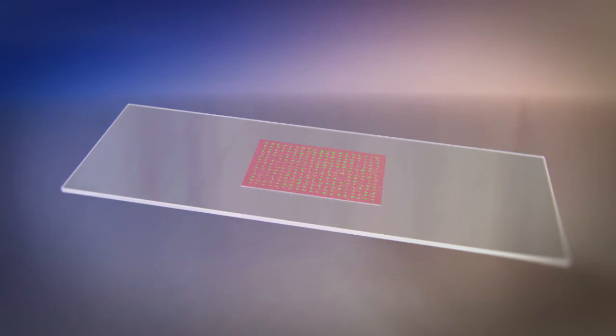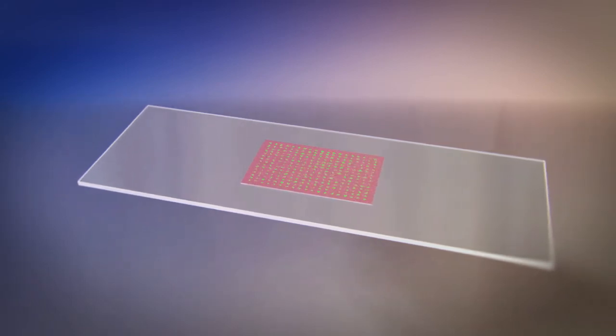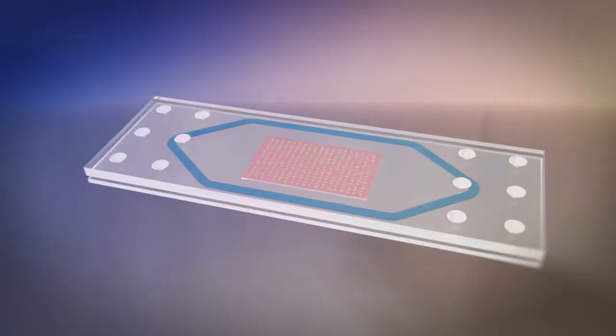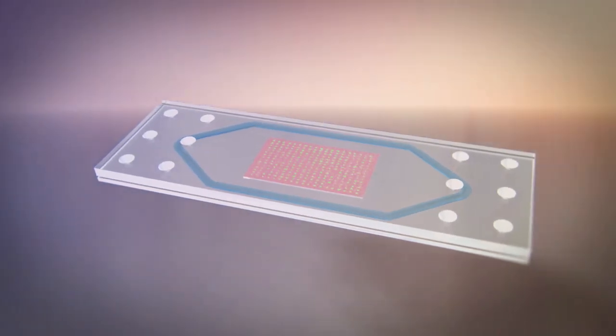First, the flow cell is assembled by placing a glass cover with a gasket on top of the cell array. This assembly is inserted into a flow cell holder.